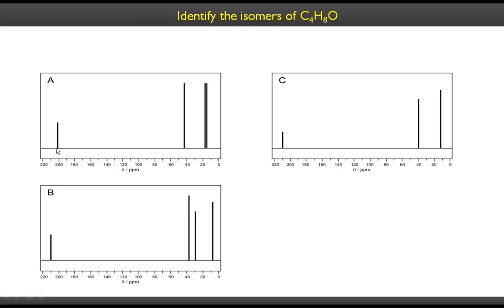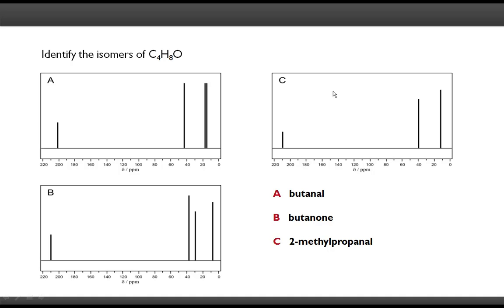So for example, there is a chemical shift of this peak at 200, whereas this chemical shift is much higher, like 210 or so. So this must be a different isomer than this one, and you should be able to differentiate between this isomer and this isomer, because this particular isomer has 3 different types of peaks in the aliphatic region. This only has 2. So can you all draw the isomers and find out? Yes, we should be able to do that.